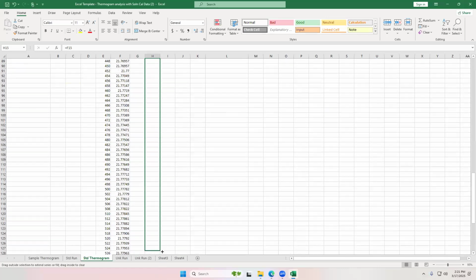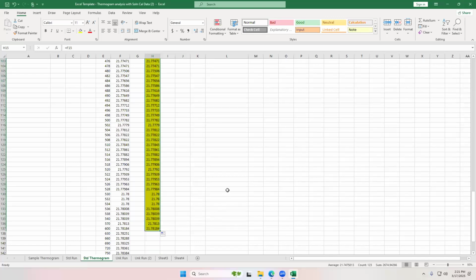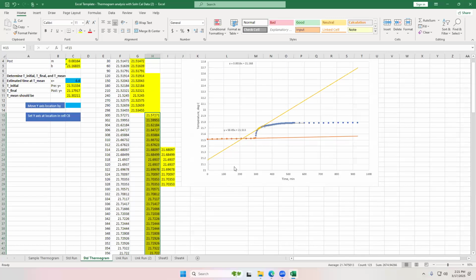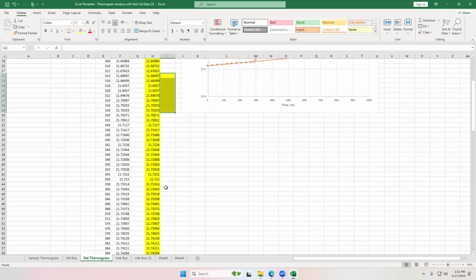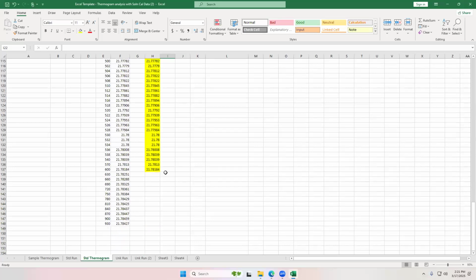So the middle part of my chart goes from 300 to 600, maybe. And what do you notice? I got a smooth curve through that, but the last part, I don't want these, right? I want all the data just starting from around 600. So I'm going to get rid of this one. Okay, so now it's gone, but I want to fit a trend line starting from 600 all the way to the end. So I'm going to say right here at 600, this is equal to the temperature at 600. Highlight that, just so I know that that's a formula, all the way to 930.